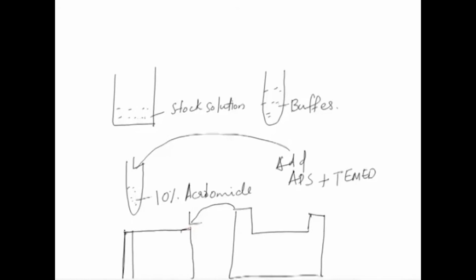These spacers, which are only a few, say 0.5 mm or 1 mm, will be placed in here, and this plate will be placed on top of this. So, this plate is being put on top and they are being separated by the spacer. All right. So, there is a gap between the two plates. This has to be understood: when the two plates are put on each other, they have a gap because of the spacer.